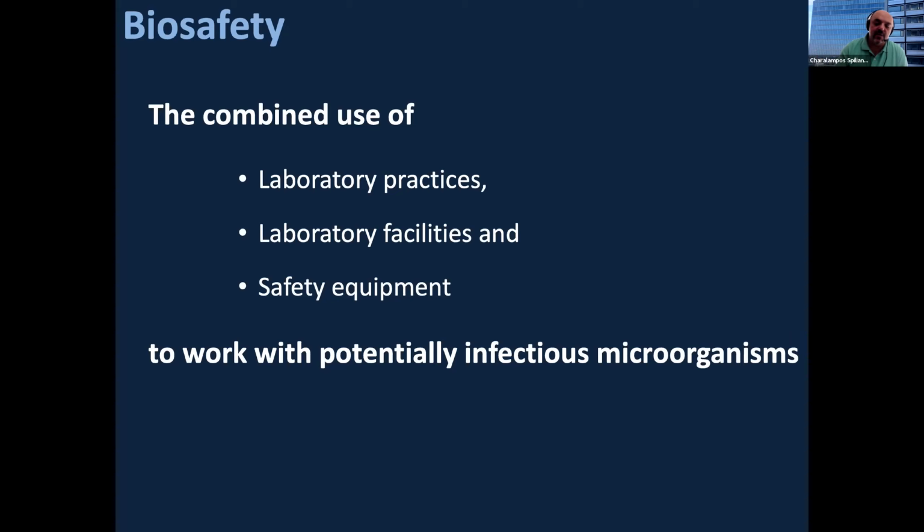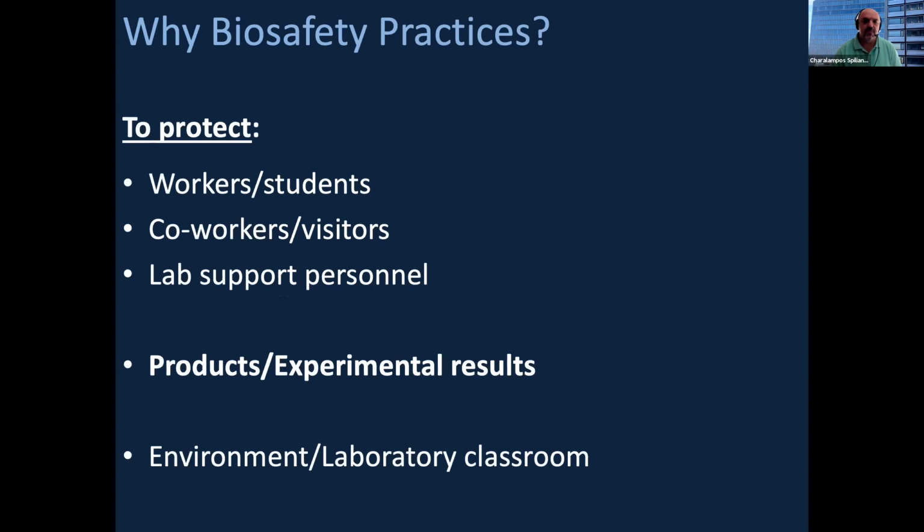We need biosafety since we're working with infectious microorganisms that are potentially dangerous, or even not dangerous, to people or the environment. And we do need biosafety practices because we need to protect ourselves. We need to protect everyone that is working in the lab, including, for example, students. We have a lot of undergraduate students, master's degree students or PhD students. All of these have to be protected by following specific biosafety practices.